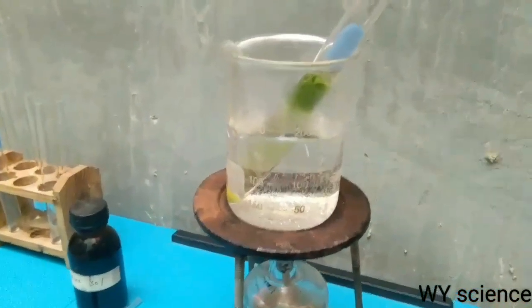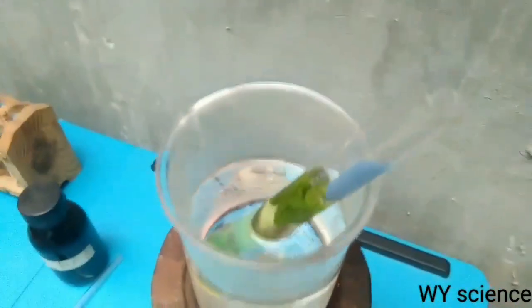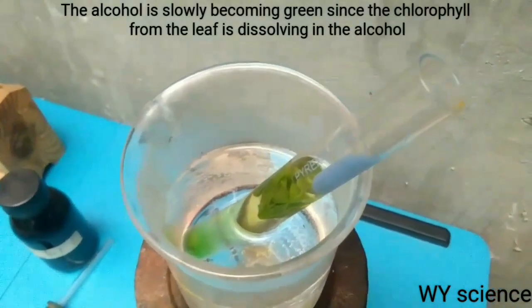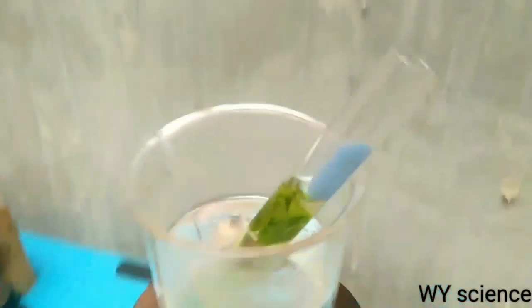Let's have a closer look at what's happening right now in the experiment. We can see that the alcohol is slowly turning green. This is because the chlorophyll in the leaf slowly dissolves in the alcohol in the test tube.